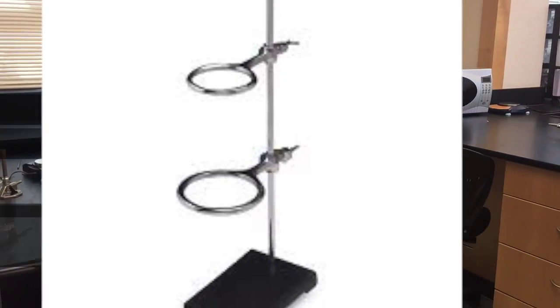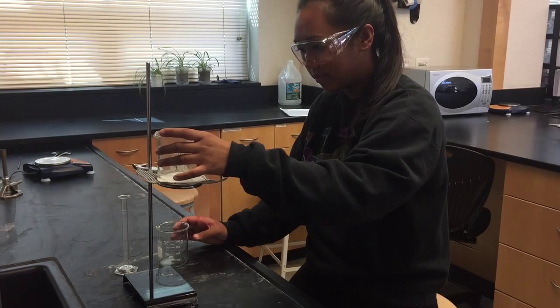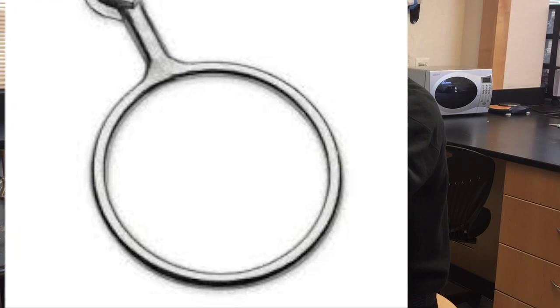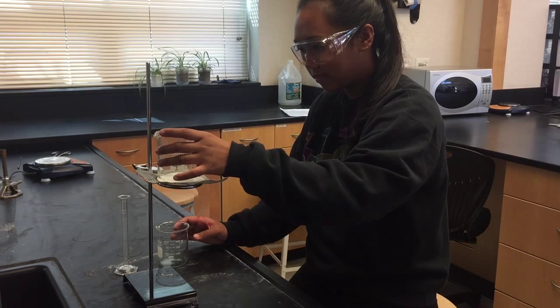This is an iron ring stand. It holds the iron ring. This is an iron ring. Its purpose is to support or hold something, such as a beaker, above your work surface.